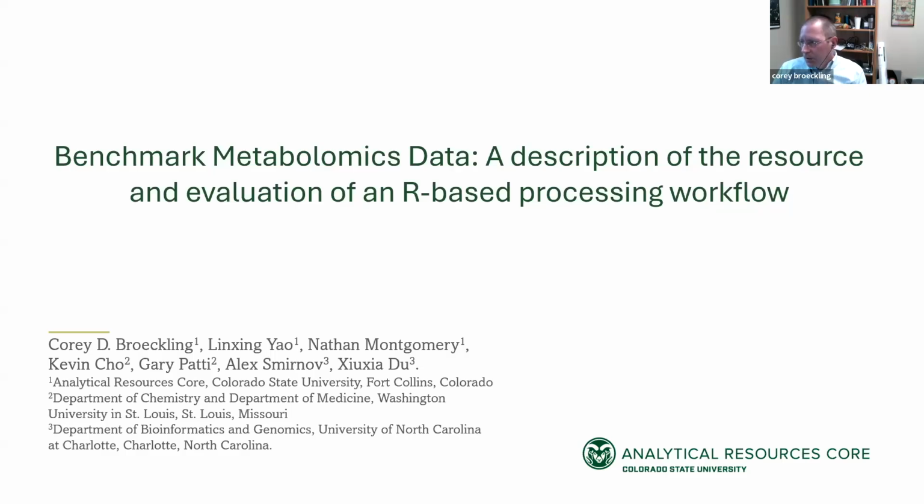And this was a collaborative effort that has been a long time in developing, quite honestly, which originated out of the NIH Metabolomics Common Fund Consortium and some of the supplemental funding that came with the grant that we were on together, where we wanted to put together a resource that will enable benchmarking of metabolomics software. So that's the quick preface for what we're talking about today.